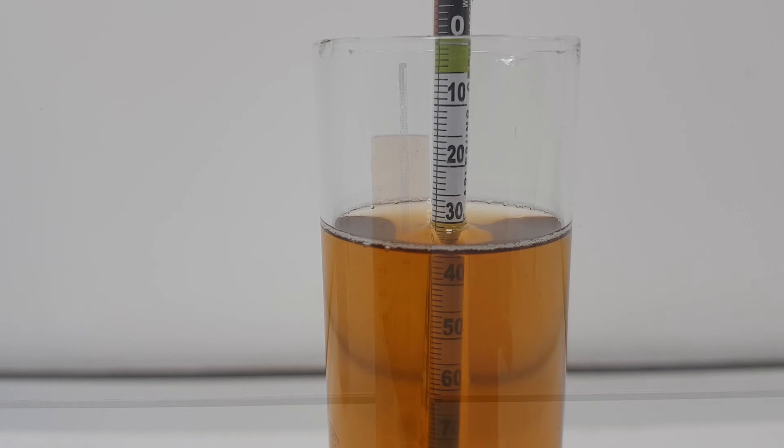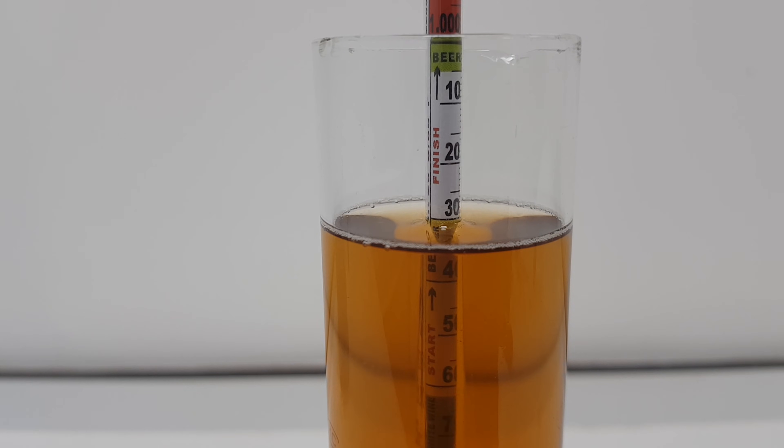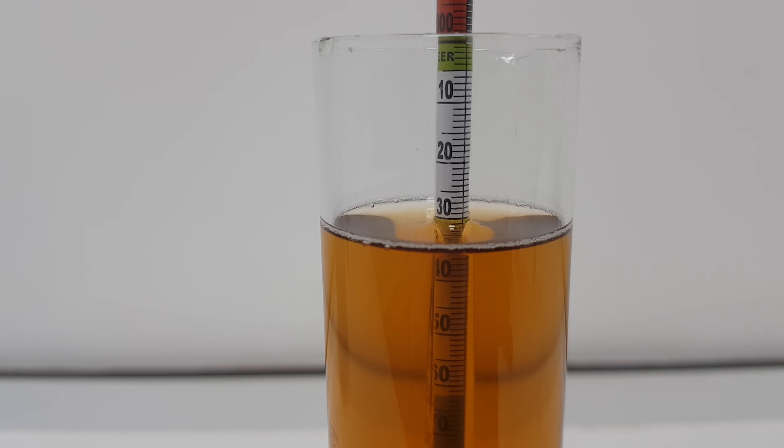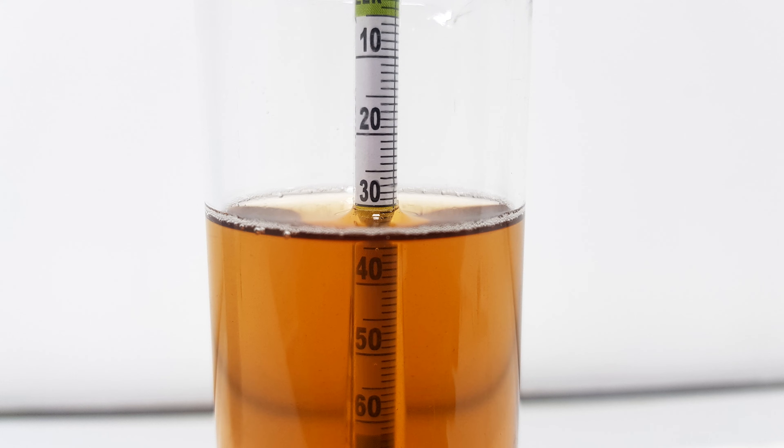Once the spinning stops, you should be able to take a reading. Be careful not to disturb the hydrometer as you do this, and don't forget to adjust your measured value if the temperature of your sample differs from the calibrated temperature of the hydrometer. Here, for example, we have a specific gravity of 1.030.